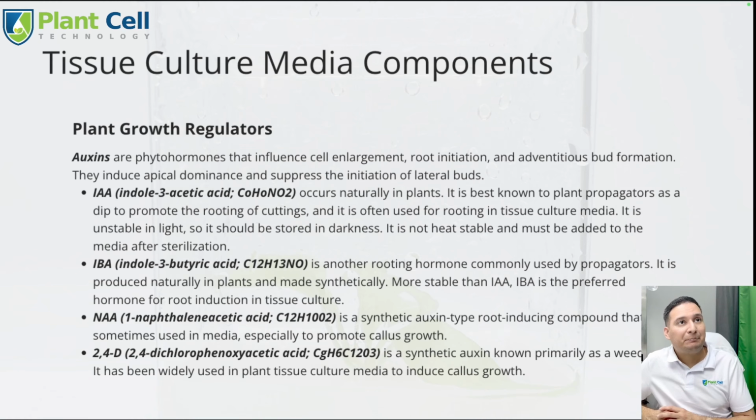Then NAA is also a synthetic auxin. It is great for promoting roots. However, it also promotes a lot of callus formation. So if you're looking to grow callus, NAA is great. However, in most cases, especially for houseplants, I don't want to grow callus.